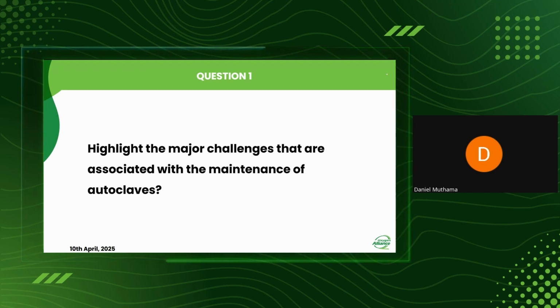So in that line, when our engineers are replacing the element, it is very important to check the wattage of that particular electric heating element. Also, the number of elements: if there are 2, you should replace 2. If there are 3, you should replace 3. If there are 3 and the autoclave has low heating, and these elements have worked for a longer period of time, you should not replace 2 and leave 1. You should replace all of them at the same time.